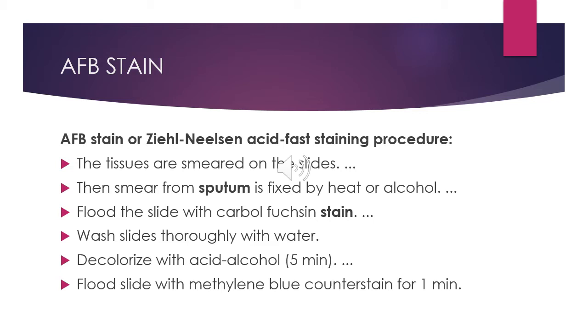The difference, and you may remember this, in Ziehl-Neelsen, remember? Ziehl-Neelsen, hot. It means that you apply heat in the staining technique to add affinity of the primary stain, which is carbol fuchsin, to the acid-fast bacilli.